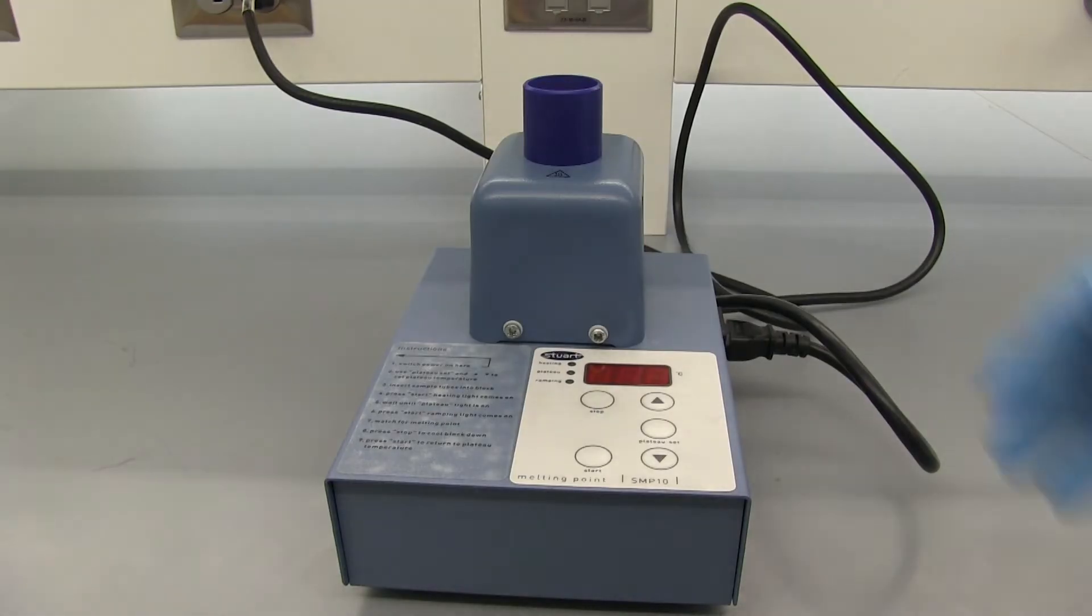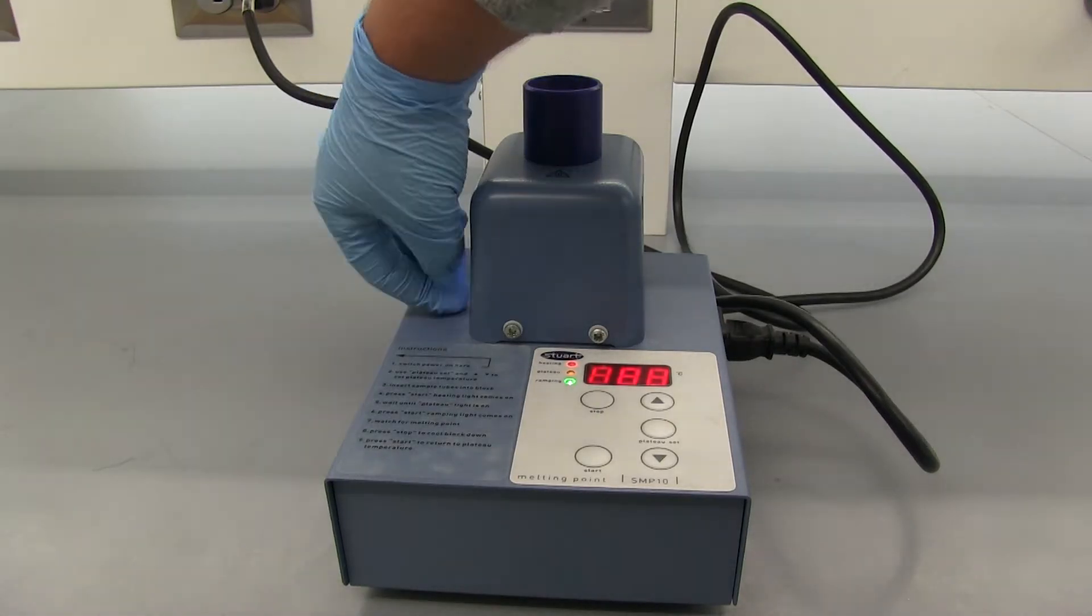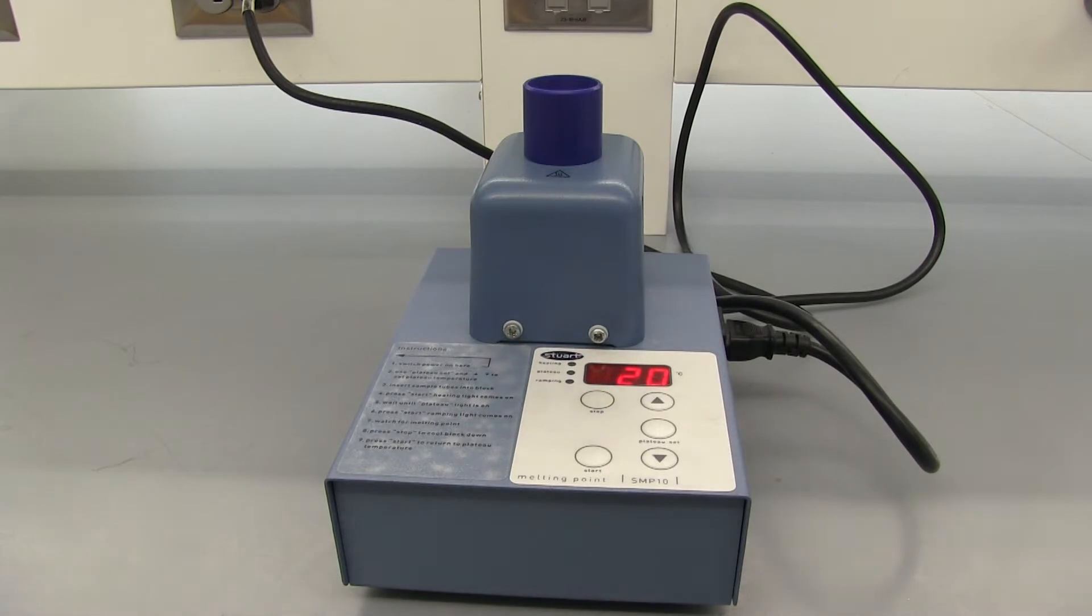Alright, so this is our melting point apparatus. There is a switch here on the side. There's also instructions on how to operate it here. First thing we're going to need to do is set a plateau. So the plateau is where it's going to stop heating and then if we're doing a slow melting point we can ramp it from there. If not, we can turn it off from there.